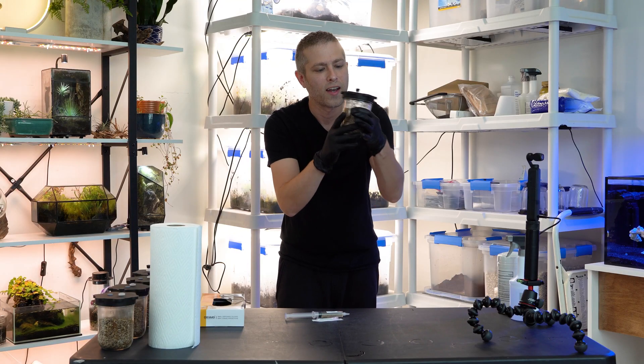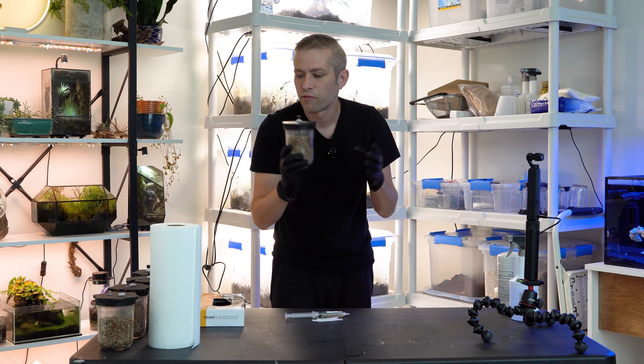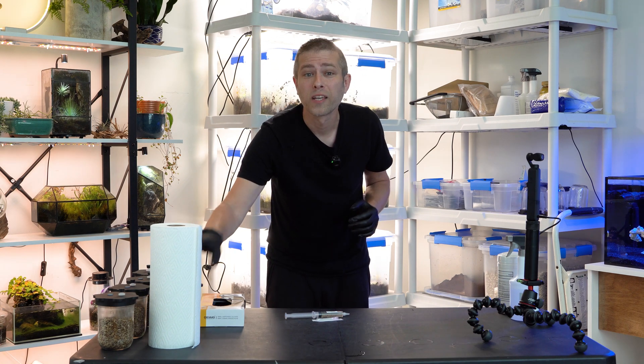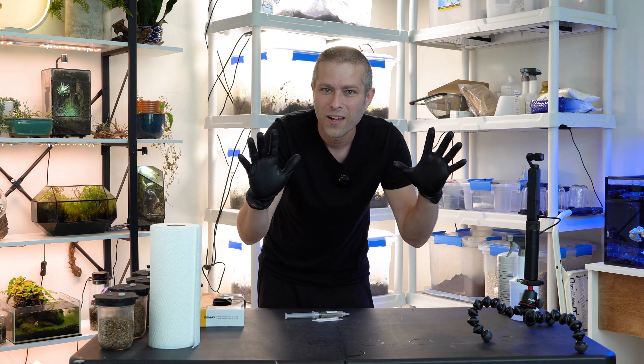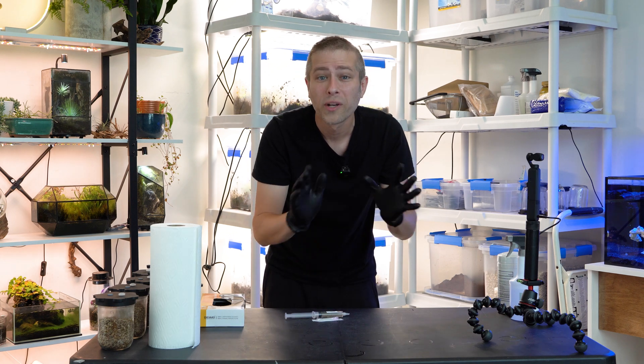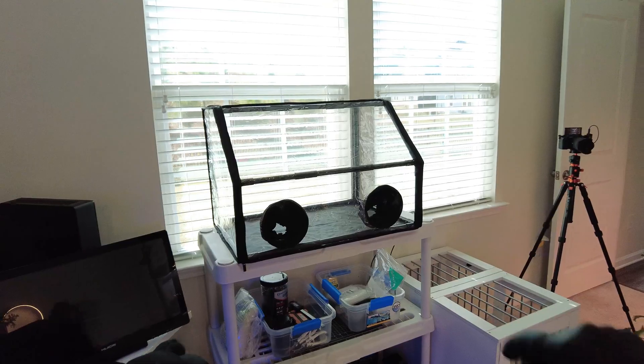Now that our grain jars are prepared and everything inside is sterilized, everything from this point forward has to be spick and span — as sterile as we can possibly get it. I've already got my latex gloves on to keep contaminants from my hands out of the project. We're going to be using a still air box as an extra layer of precaution, because at this point the mycelium in this liquid culture syringe is at its most vulnerable state. Contamination will always be an issue, but it becomes less of one as the mycelium gets stronger.